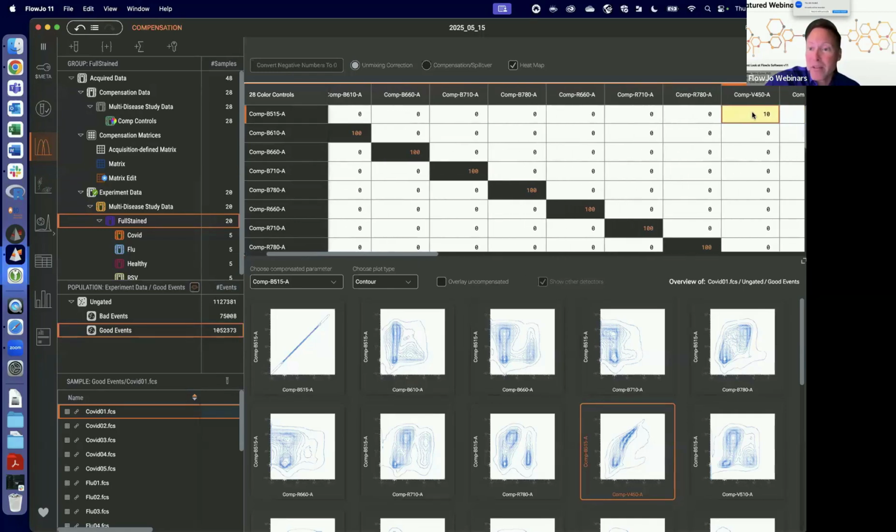Yes, we can do negative numbers as well. Okay, so negative and too much. I'm working it just in too large a number. I mean, it doesn't matter, but whatever. Let's just take that back to 5. So negative numbers are important. We do believe that they will occur when you have a skew distribution. Not everything is perfectly symmetric, and sometimes the skew goes the wrong way, and you need to do essentially anti-compensation. So it's in there. All right, 10:38. Gotta move.